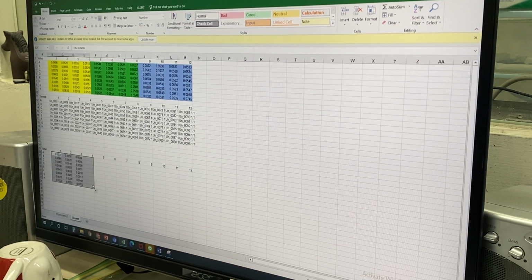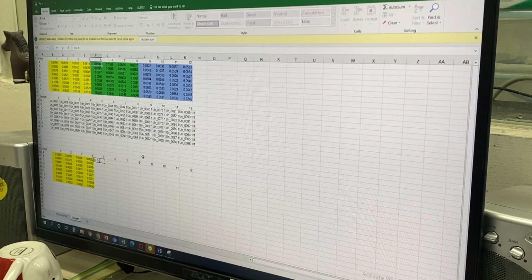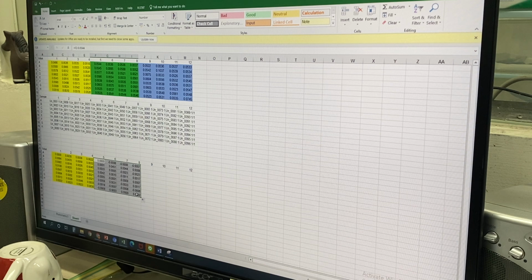So this is your first replica is completed. Okay. Second, your replica, that's equals to this one minus 0.0544, right? It becomes 0, right? Okay?